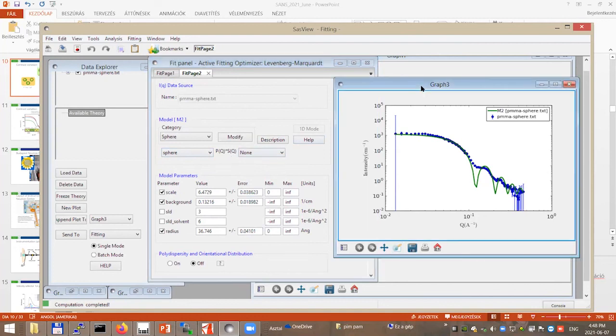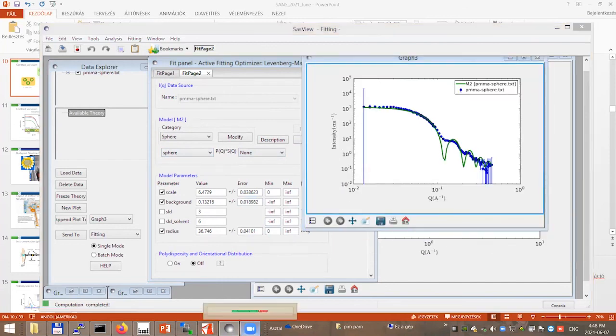But you said that these amplitudes are small in certain cases. What is small? The amplitude, the peaks here, they're small. They are not so pronounced like in the fitting model. Sorry, repeat please. I didn't hear it well. So when you compare the fitted curve, you have nicely defined peaks. But if you look at the data, it's just smaller. So they don't fit for the size, the shape of the particles. So spheres are not a good model. Yeah, exactly.